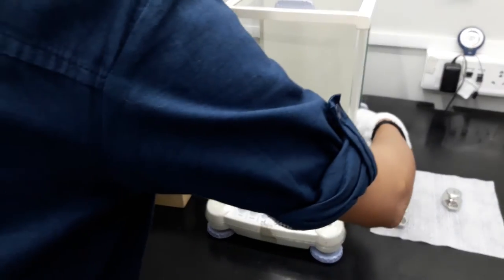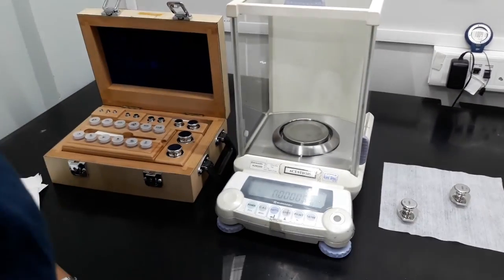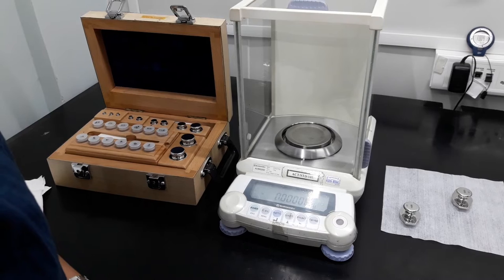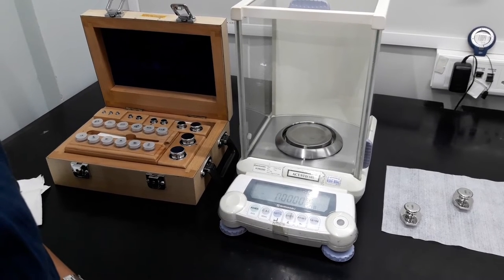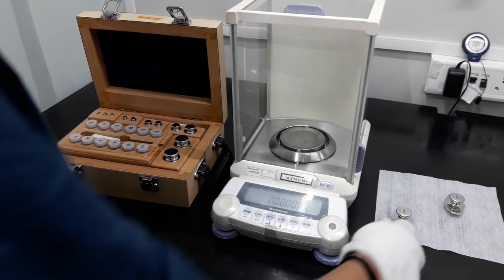Now take the UUC of the same capacity and keep it on the pan of the weighing balance. Observe the reading and note down the reading on CDS.